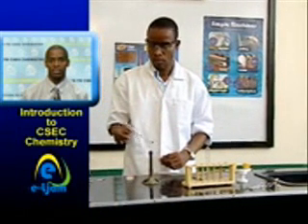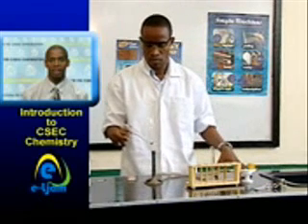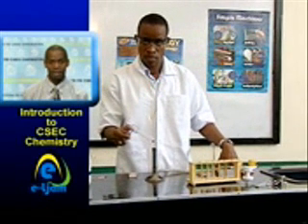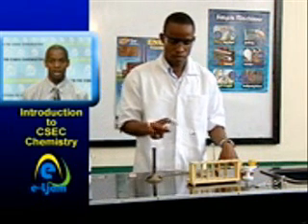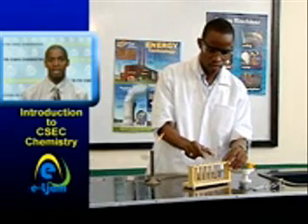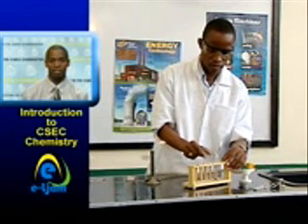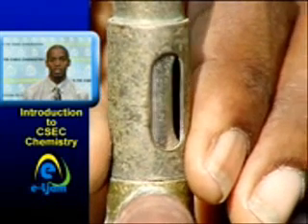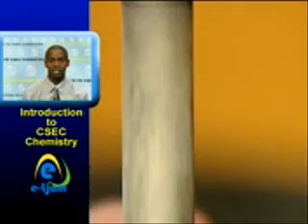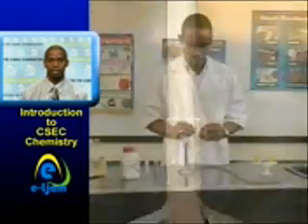The first step is to ensure safety by removing fire hazards. Lab coat on, long hair tied back, safety glasses on, books and papers away from the flame, apparatus set up not too close to the edge of the table. The second step is to close the air holes on the burner. The holes can be adjusted to let in more or less air by turning the collar.